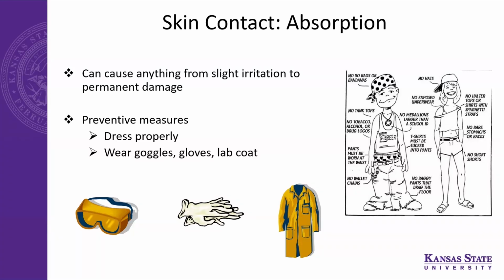And recently, we introduced a special type of lab coat, called the flame-resistant lab coat, for the type of work that you perform in a lab. For example, all the professors in the chemistry department did not go to that option, because if you don't do any work related to fire hazards, then you don't need that. A standard lab coat will be good enough in that case. But if you are dealing with fire hazards, then those professors decided to upgrade their lab coats to the flame-resistant lab coats.